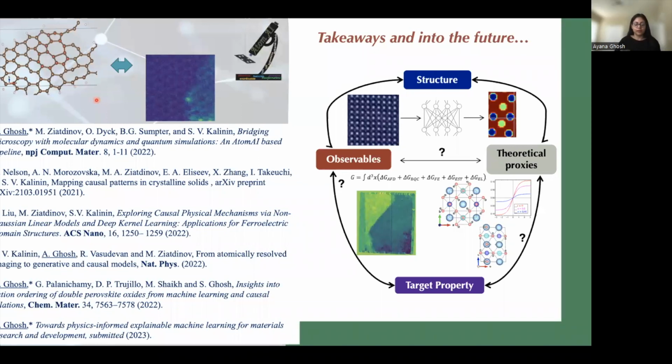But using the pick and choose of regions of interest, because we cannot really perform the simulations on the fly in a timely manner to give a feedback signal. Like, oh yeah, place your dopant there, or do your defect construction, or hit your electron beam in this region to create this defect.